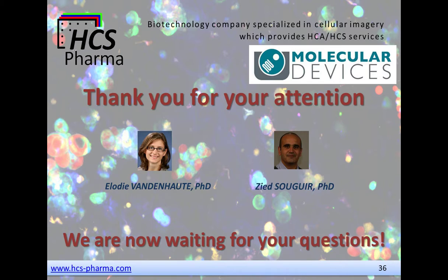Okay, next question. What do you mean by it can be applied in vivo? We just mean that it can be used for grafting in mice. I mean, you can seed cells within the matrices and just take the matrix, it's solid. You can graft it in mice, and this has already been done with a collaborator.